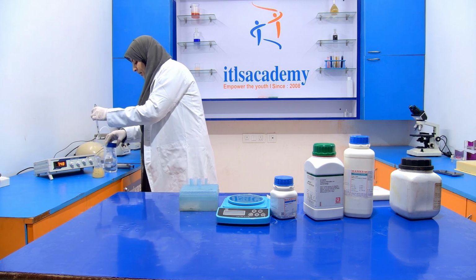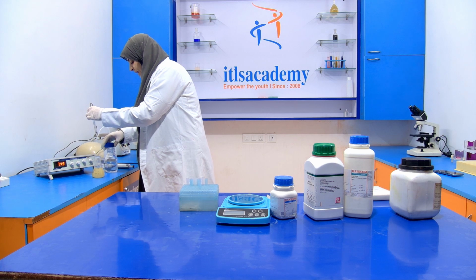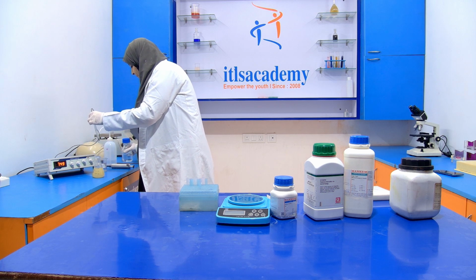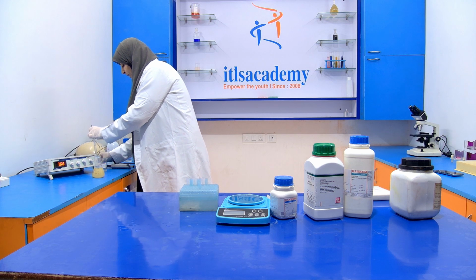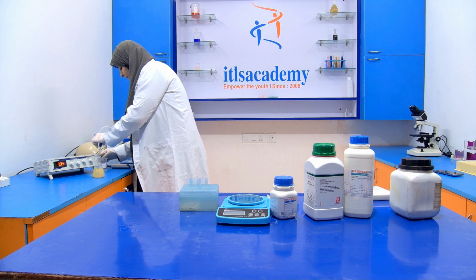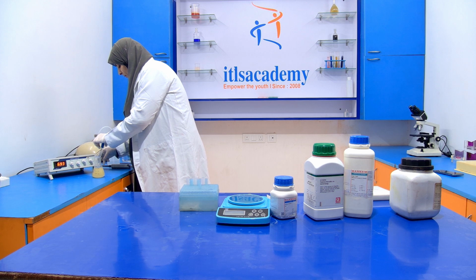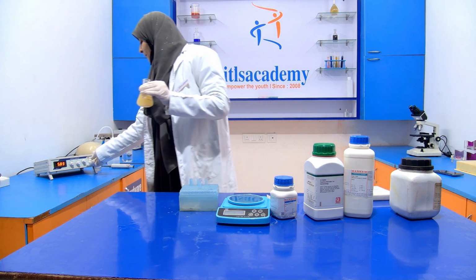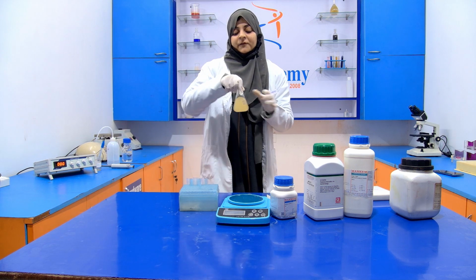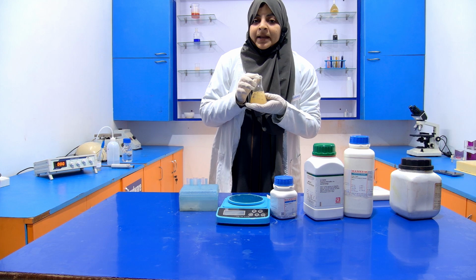Now again, we have to wash the electrode with the help of distilled water and dip it back into its solution. Now this is how we maintain our pH with the help of that digital pH meter. Now our media is ready.